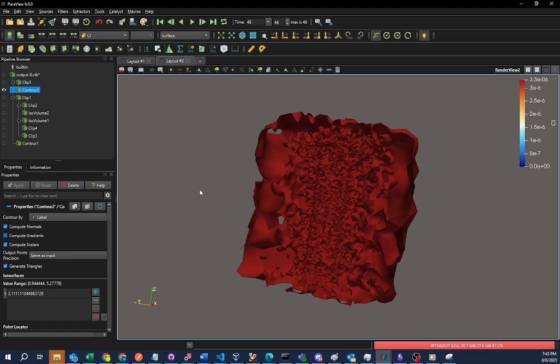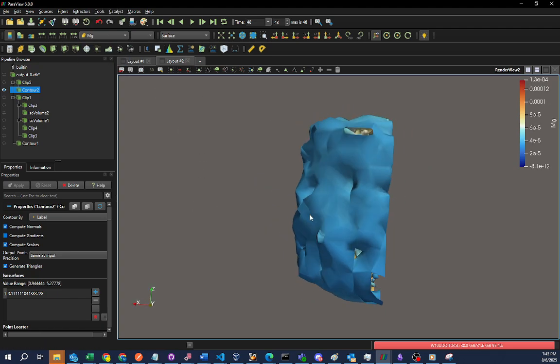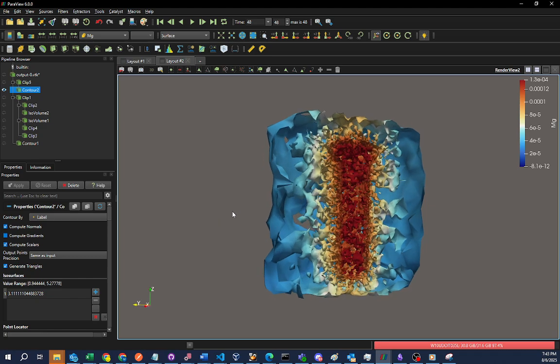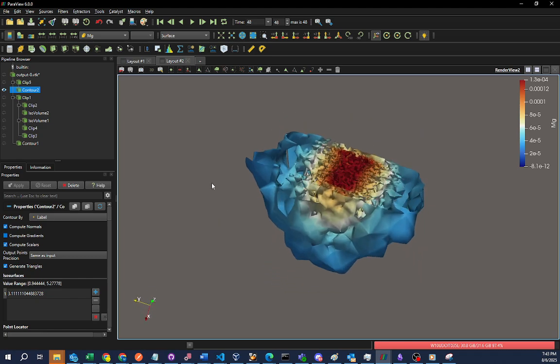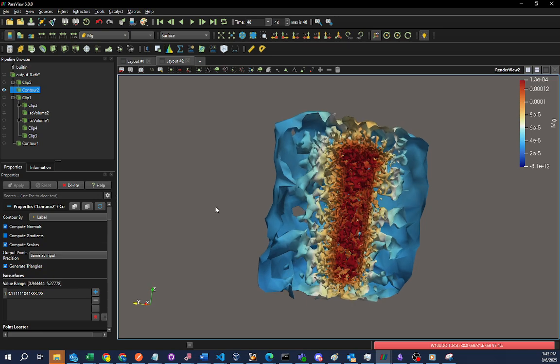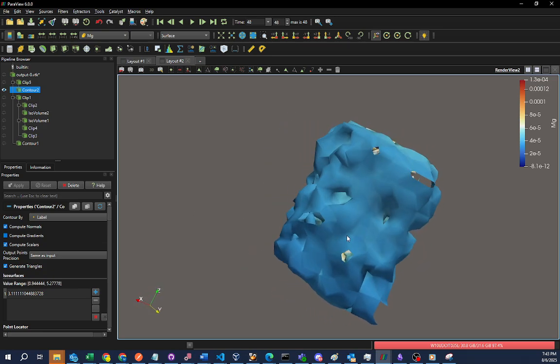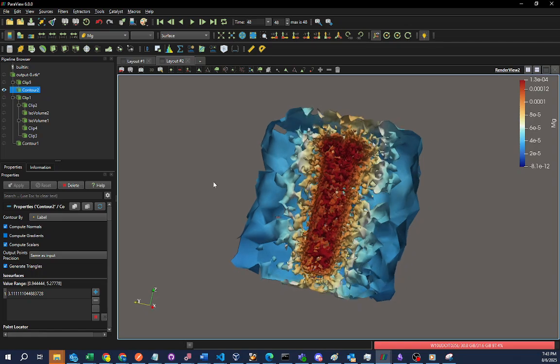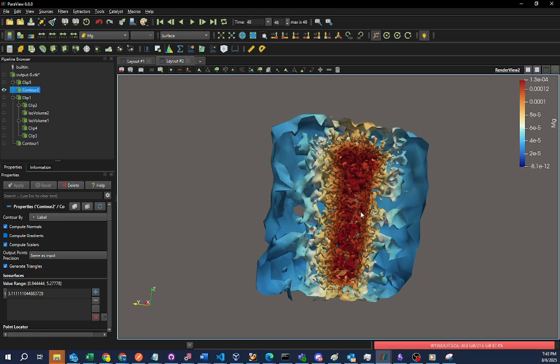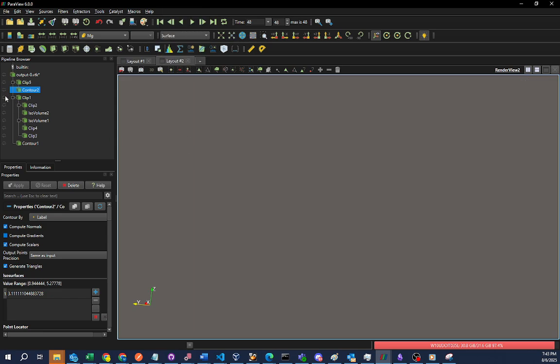Contours are not that useful, but it is there. It allows you to see the surfaces of the points, basically. I think it might be useful in other data visualizations, but it does kind of help. You can see it's still sort of useful.